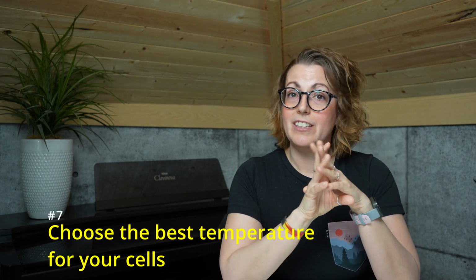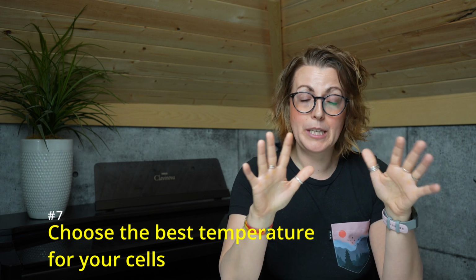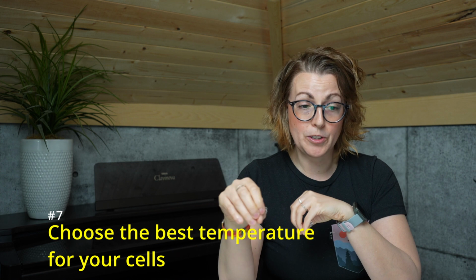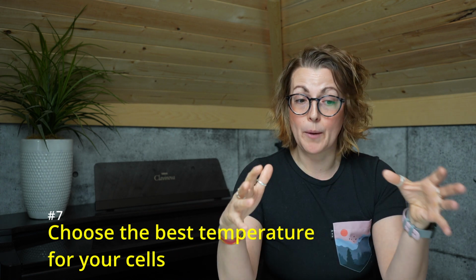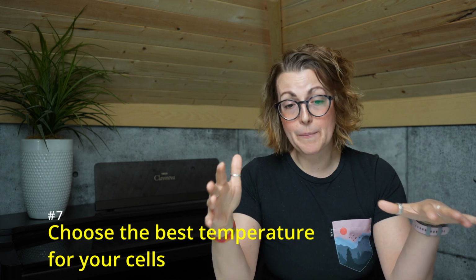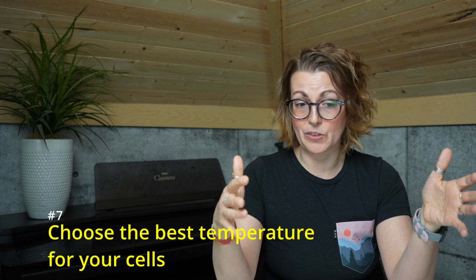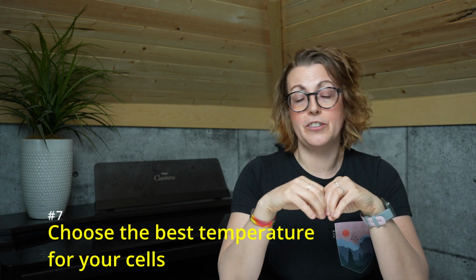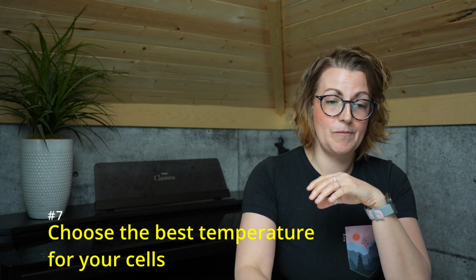Number 7, as a general rule of thumb, keeping your cells cool will help maintain viability. Most sorters will have the ability, the option, to have the sort and collection chamber cooled at room temperature, and some even at 37 degrees Celsius. So make sure you choose the setting that's best suited for your cells and your downstream assays.